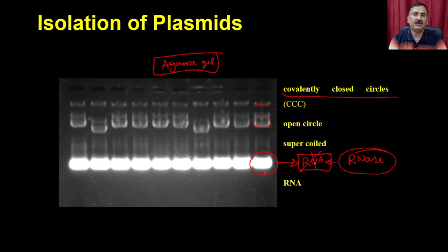So this is all about the plasmid isolation, and we have prepared a small demo clip so that you can become more familiar with the different processes. In this particular demo clip, we have covered the manual method, and we have also discussed the kit method as well.